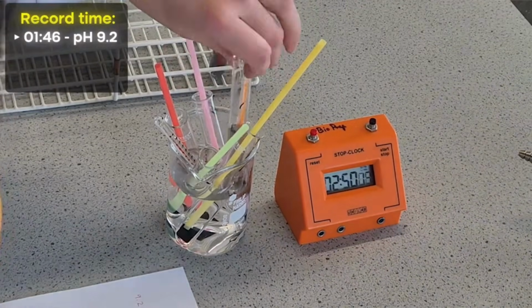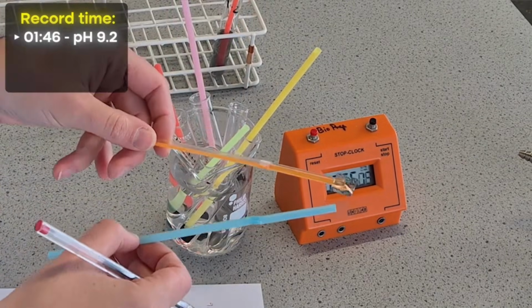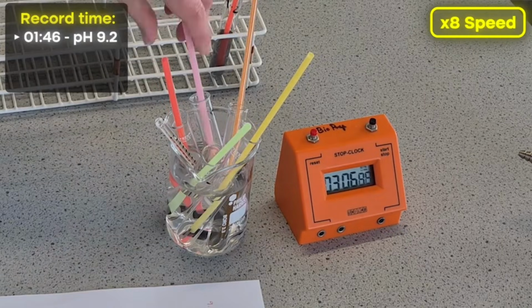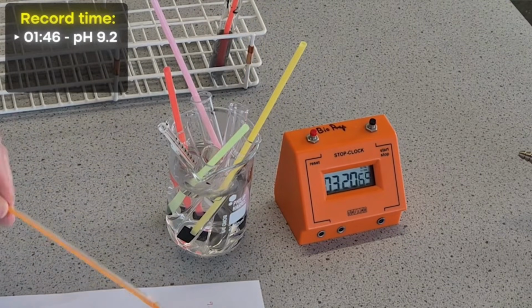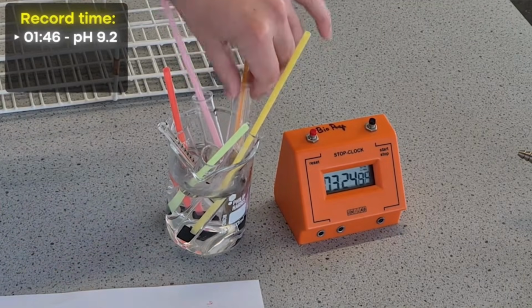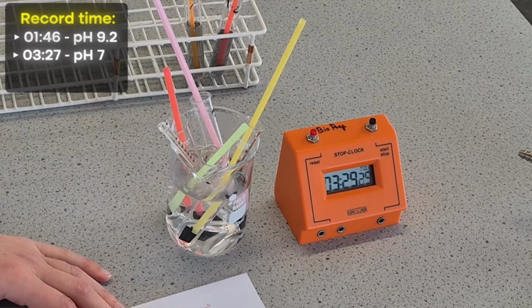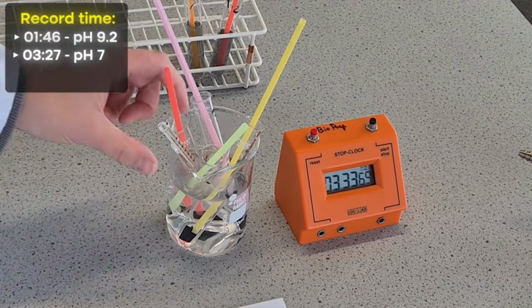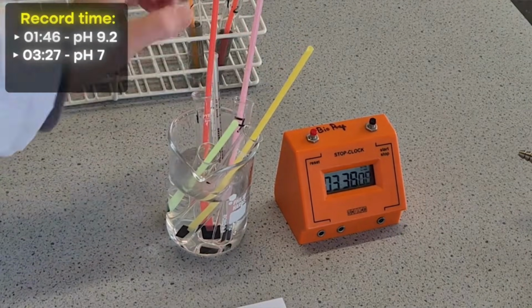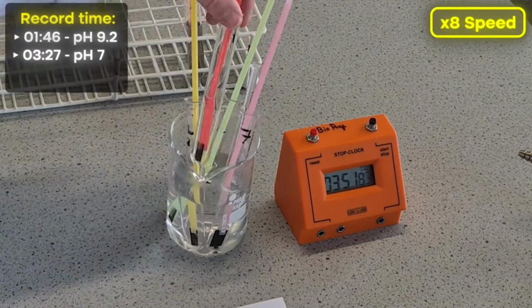So this one looks like it's nearly done. So this is pH 7. So I wouldn't say that is completely clear. So put it back in. Okay. So I'd say that one is done. So that's our pH 7, 327. Which means we now only have one left that we think is going to change.